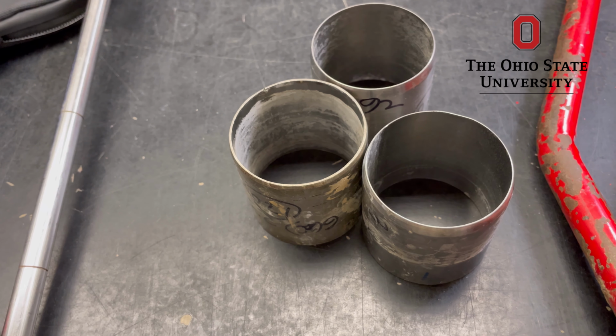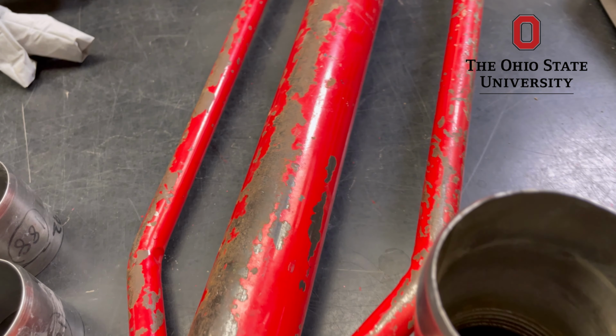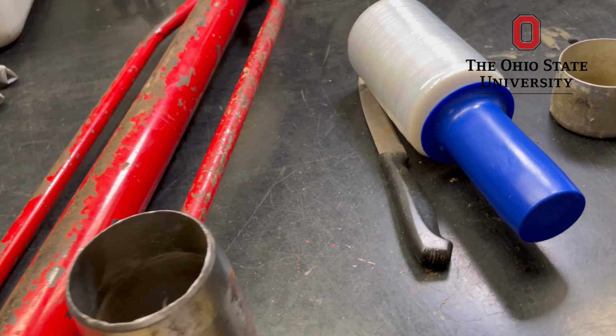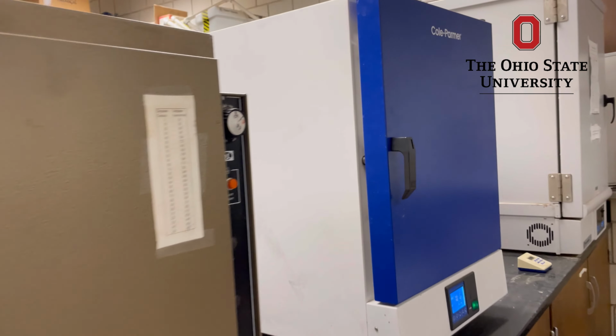The materials that we require: a metal soil core of known volume, a core sampler or hammer, a knife or spatula, plastic wrap, aluminum moisture tins, a balance, a 2 mm sieve, and an oven set at 105 degrees Celsius. The first step is collecting the undisturbed core.